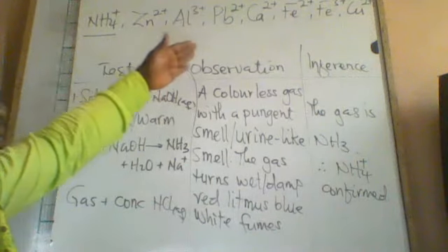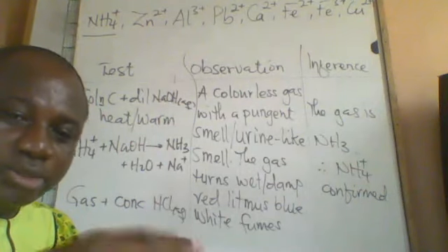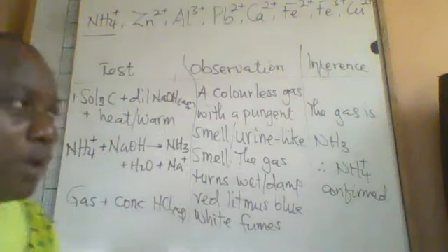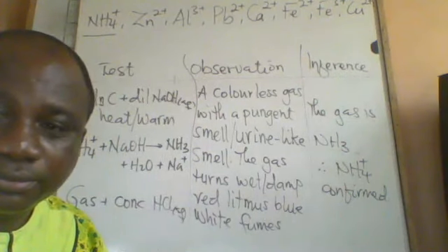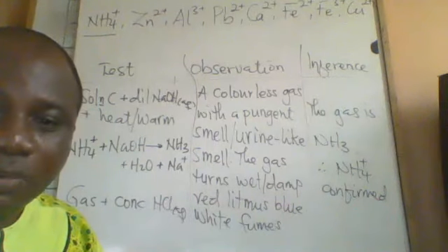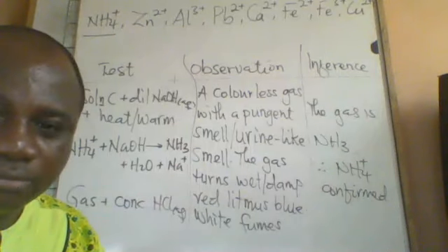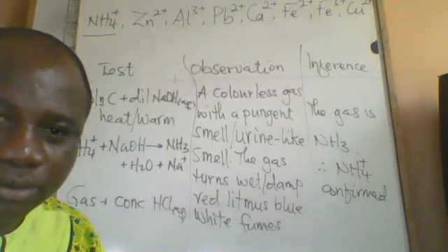As for the rest, which we will consider soon, we use both the sodium hydroxide solution and the dilute ammonia. We add them one at a time and then observe and record what we've seen. We don't do two at the same time; we add them separately.